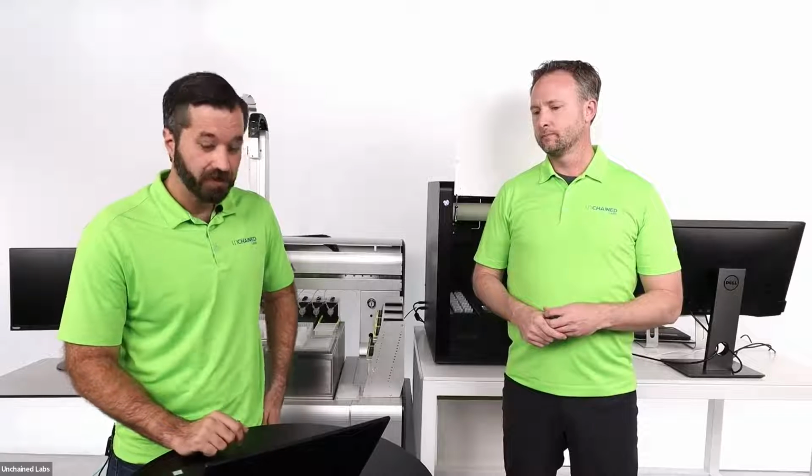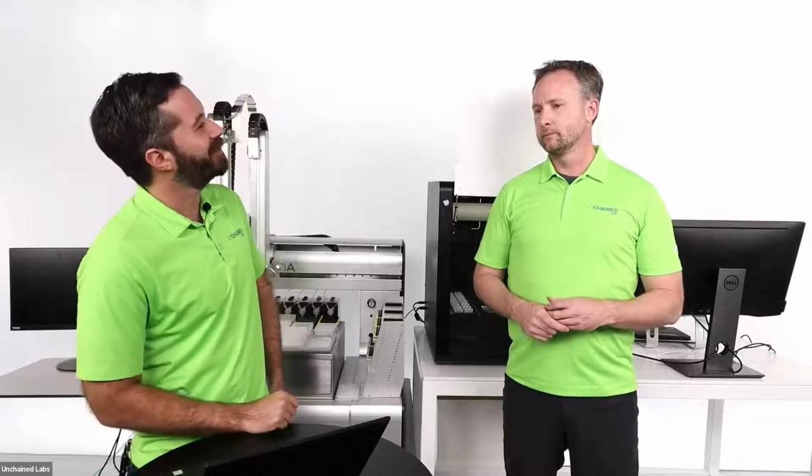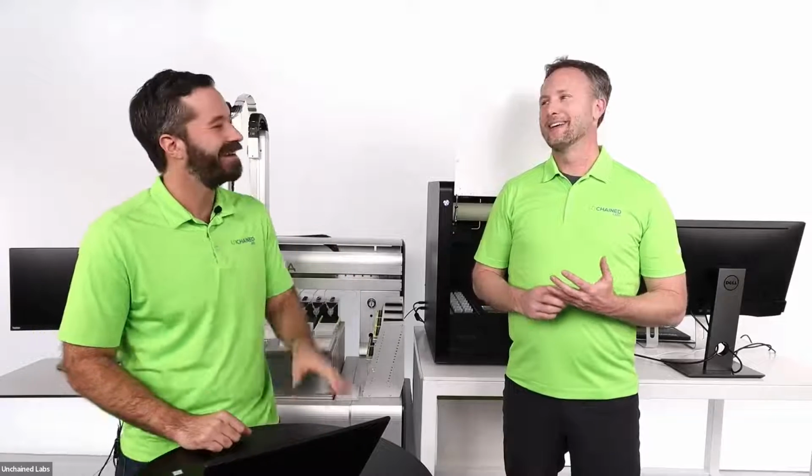Okay. What if I enter the wrong volume for a sample? I'm sure everybody's made a mistake on software before like that. Yeah. So what happens? Yes.